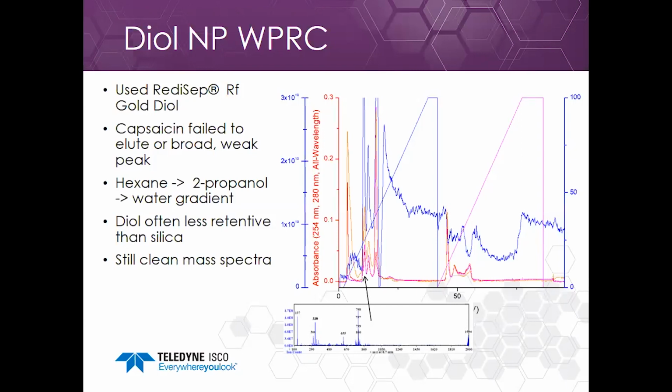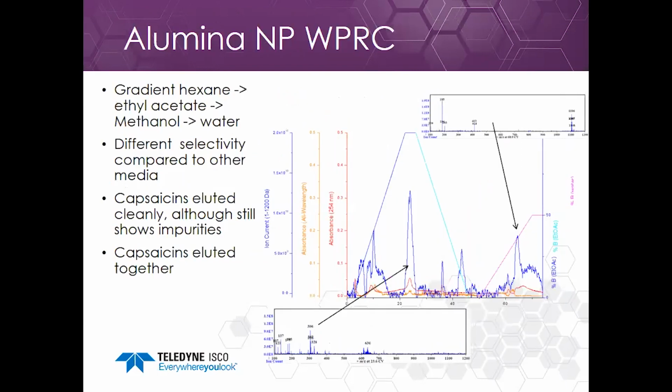It also has a different selectivity than silica, and sometimes compounds that don't run well on silica run well on diol. Diol is also very useful if I'm running delicate compounds that might decompose on silica gel.